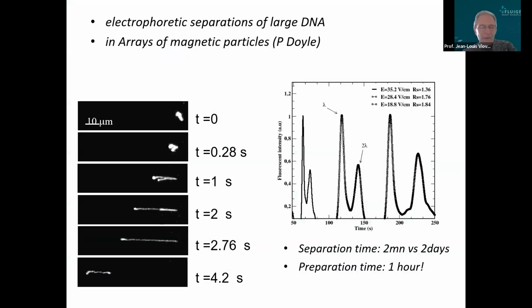To go more into what motivated us to change the paradigm of flow control: there was a lot of excitement about genomics, but at this time we didn't have NGS yet, and so most DNA analysis was done by electrophoresis, which was, compared to what we can do now, extremely tedious and expensive.